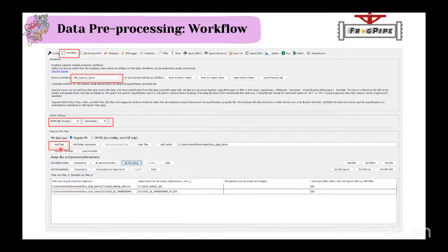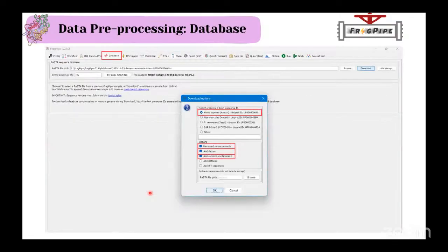And here finally, you can add your files. Once you add your files, the .raw files which are generated from the mass spec, you can sort them by file name. If you have control 1, 2, 3, here I have uploaded only two files, the HeLa and the QC. You can do uploading on the basis of the names, like control 1, control 2, control 3, and disease 1, disease 2, disease 3.